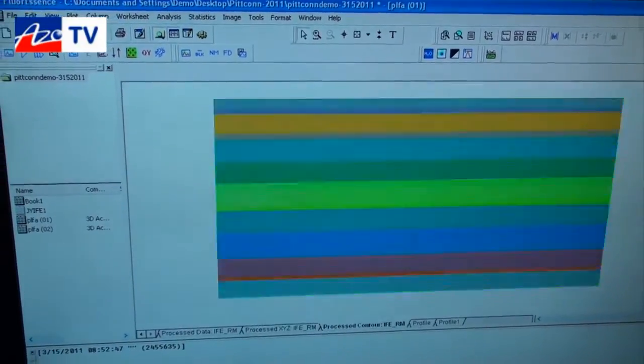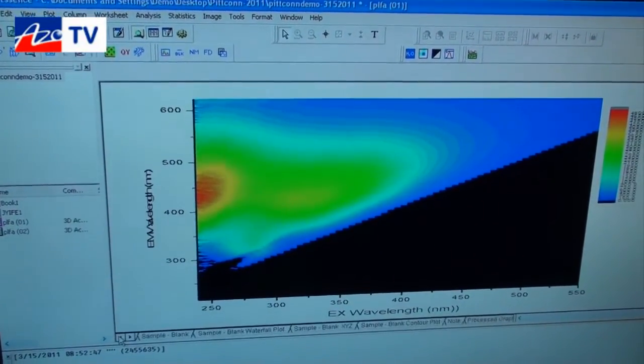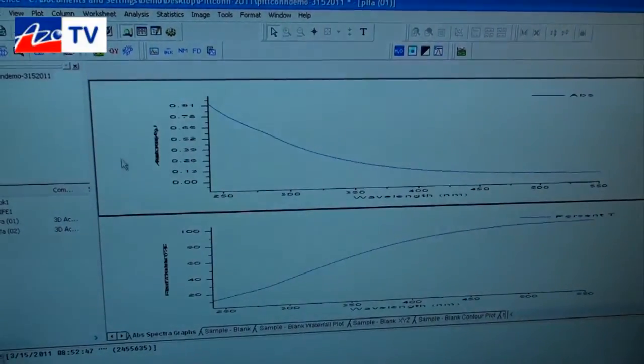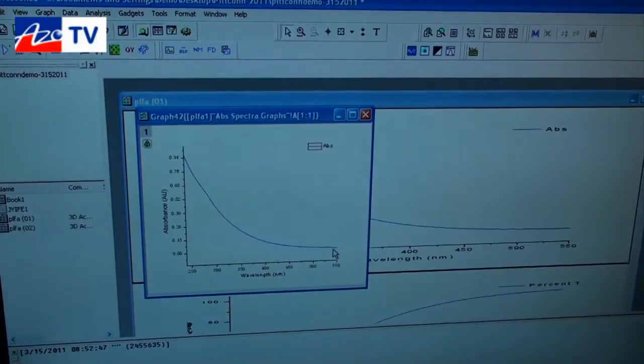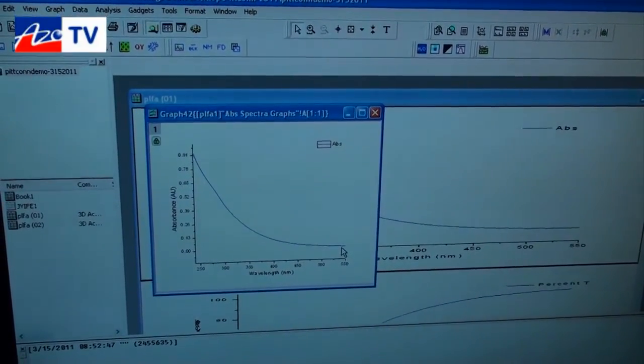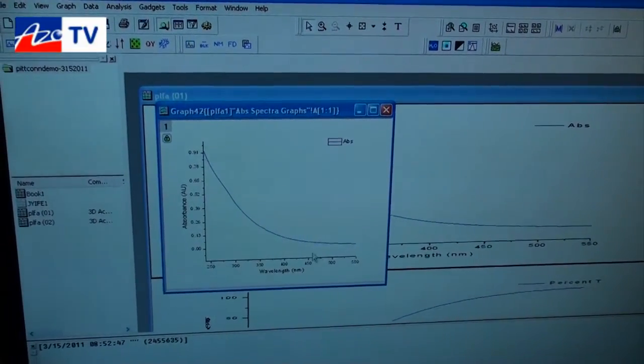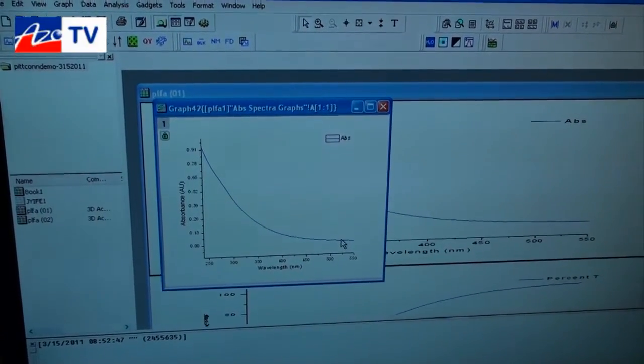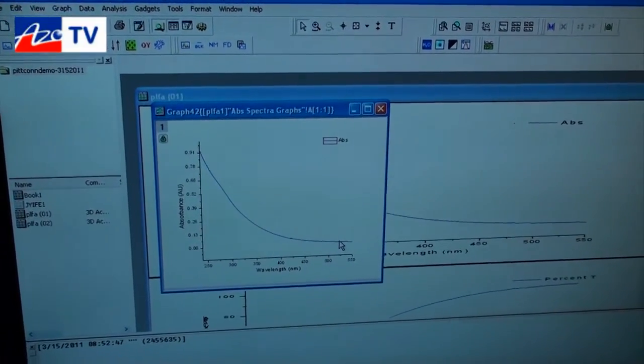At the same time we also acquire an absorption spectrum, and the absorption spectrum is important for two reasons. It's important because it's measured simultaneously with the fluorescence so you have a kinetic match, and the data from the same instrument is available for the processing.